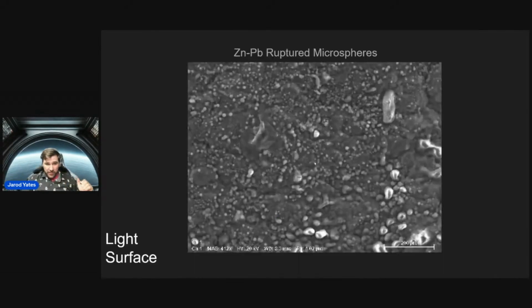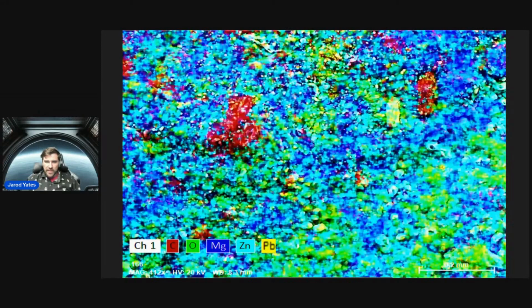So on this particular image, you can see we have some weird morphologies going on. There's like this big deal going on over here. We're at 200 microns right here, right? So this thing's like 75 to 100 microns long or something like that, compared to all of these 15 to 30 micron seeds or microspheres. Here, I'm comparing that with our EDS. So for reference, that seed thing that you saw is right here. I'm going to do a GIF that overlays the two here in just a second. But first, I want to go through what you're seeing on this image.